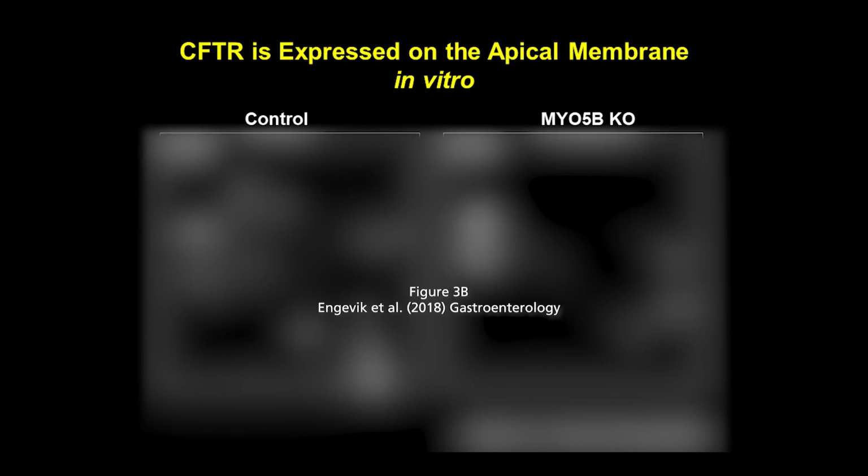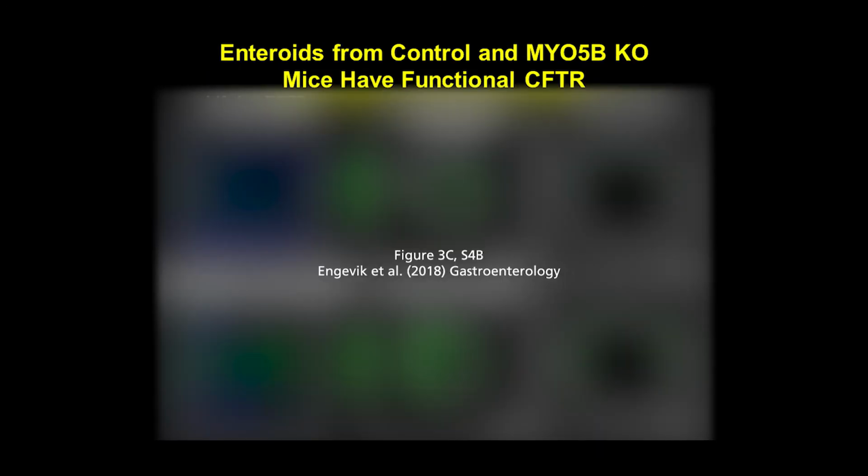We were able to cross the myo5B knockout onto the LifeAct EGFP mouse. LifeAct binds to F-actin, so you can actually visualize F-actin. The straight LifeAct mouse has nice brush borders shown here with the F-actin. When you look at the LifeAct myo5B knockout mouse, you can see apical actin, but there are lots and lots of F-actin positive inclusions throughout.